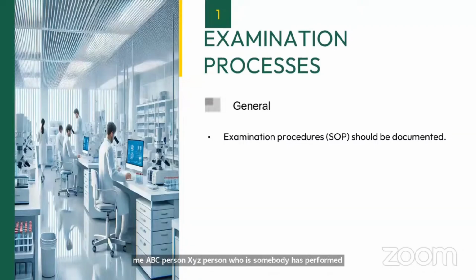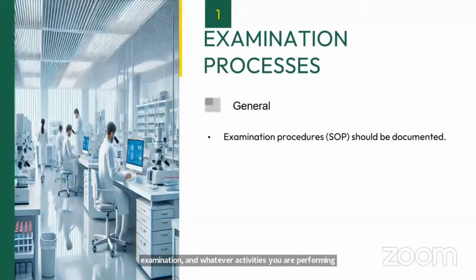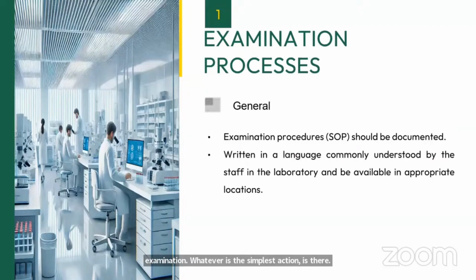If a standard operating procedure mentions that you have to incubate for 10 minutes, then if today I am performing the examination, I will wait for 10 minutes. Tomorrow somebody else comes, he will also wait for 10 minutes. The day after tomorrow somebody else comes, they will also wait for 10 minutes. So the consistency remains throughout your examination procedures, and whatever activities you are performing remain the same. So there should be an appropriate examination procedure. Even for the simplest action, you need to have an appropriate examination procedure which should be documented.